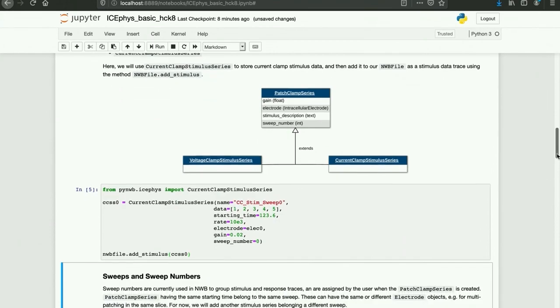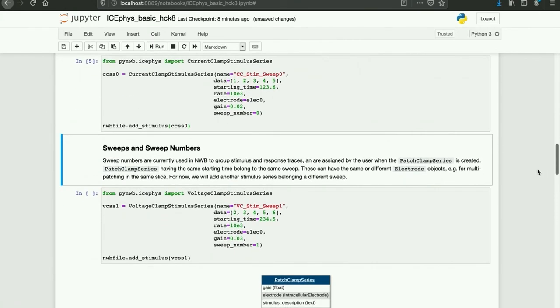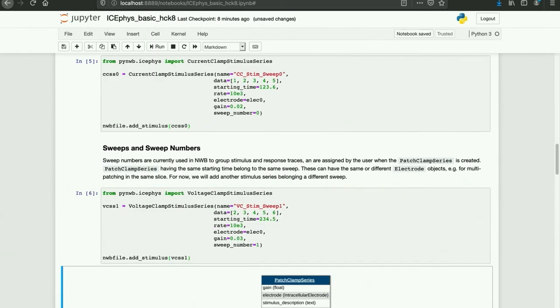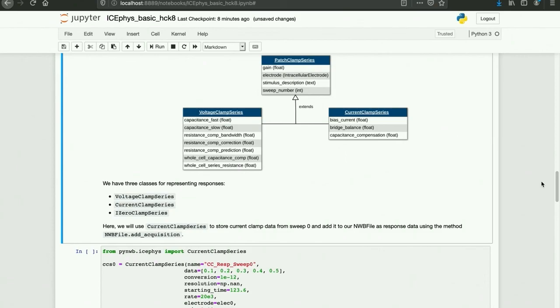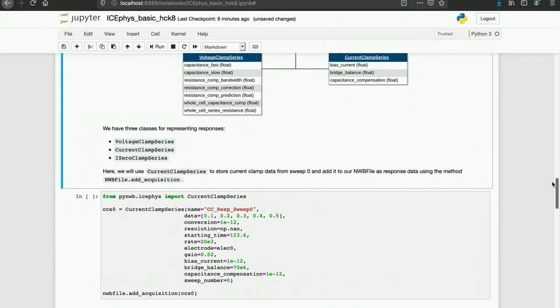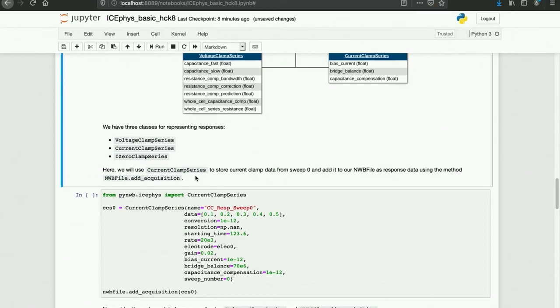Now I'm going to create a stimulus for a second sweep. This is for a voltage clamp stimulus series, just for the purposes of illustration. Now let's generate some response traces to associate with our stimuli. In NWB, we have three classes for representing responses: voltage clamp series, current clamp series, and IZero clamp series. IZero clamp series are used to store patch clamp series that don't have an associated stimulus trace. Here I'm going to use current clamp series to store current clamp data for sweep zero and add it to the NWB file as response data using the method NWBFile.addAcquisition. Note that I've included the sweep number here to associate this with our previous current clamp stimulus series.